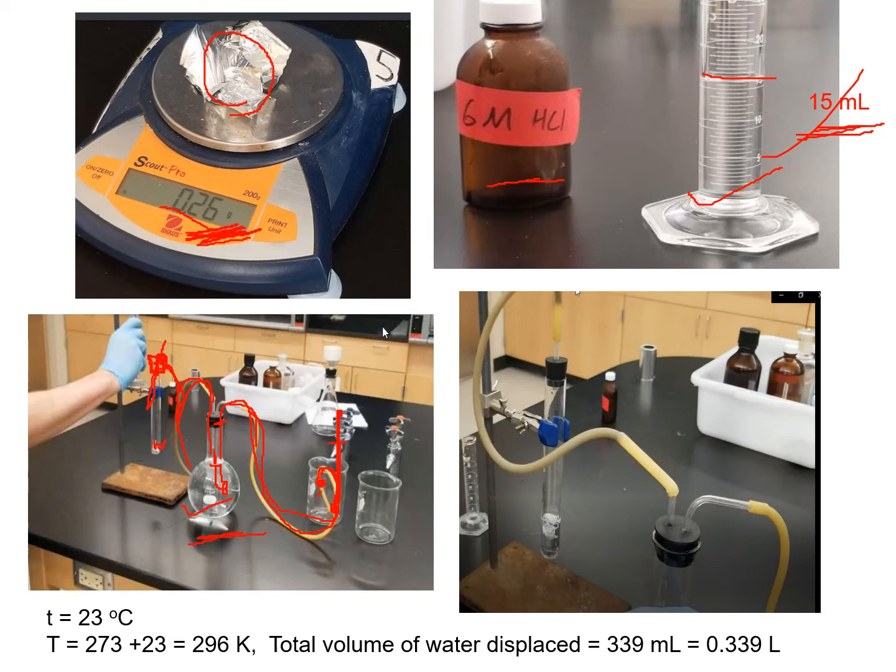And you have to put a thermometer here, and then you remove this pipe and measure the volume of this water. Measure the volume of the water, how many milliliters of water you collected here. You record that volume, and also put the thermometer here, and you have to record the temperature of that water. You see that?